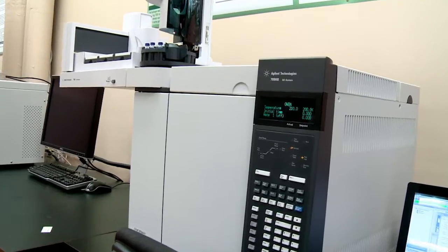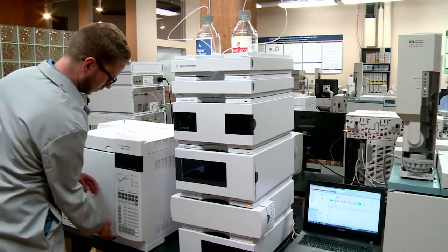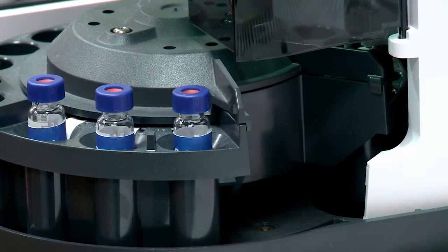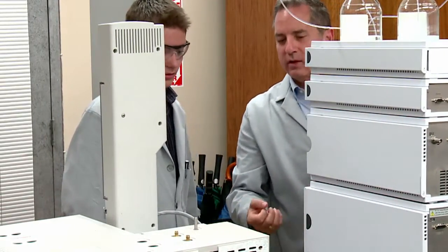One of the other common complaints we get in the GC world is that the GCs are too big. Well, it's not that the GC is too big, it's just that the combination of the lab is too small and they want to add more GCs to the lab. To me, the idea of saving bench space is really important because bench space is valuable. I mean, not only is it valuable from a dollar perspective, but it is valuable in terms of there's a lot of things that I want to have going on in the lab. So if my GC can take up less space, I could either have more GCs or more stuff going on in the lab. So that would be a great thing to put on our wish list as well.